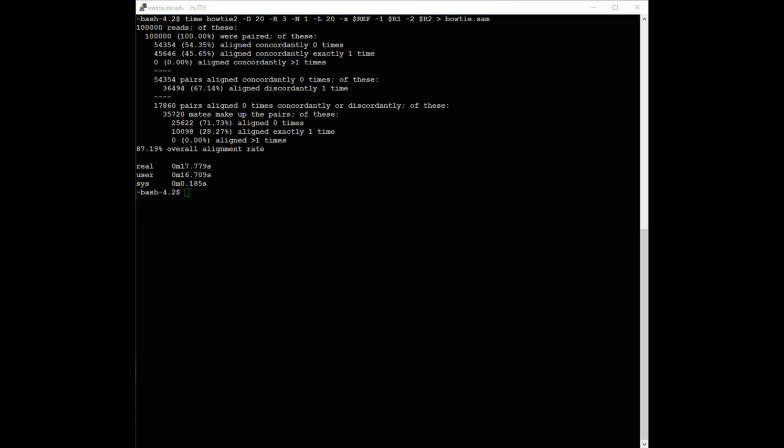And this comparison example gives us two take-home messages. First, it's not that simple to compare aligners. Sometimes even with one aligner, the same aligner like BWA, it uses different algorithms over different time periods. So it's really not that simple to compare them.